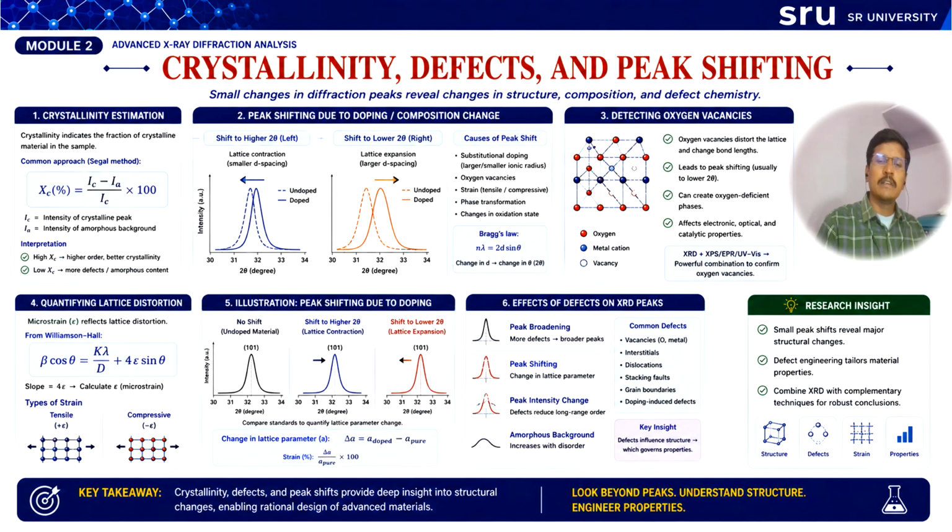That's why the structure property relationship is very important in nanomaterials research. As I already mentioned, no single technique is enough to understand the complete profile or properties of the materials.